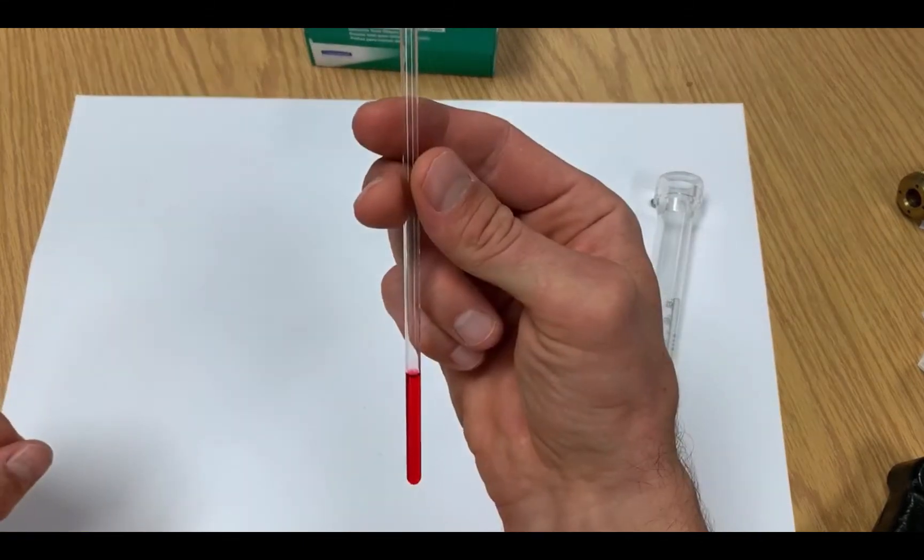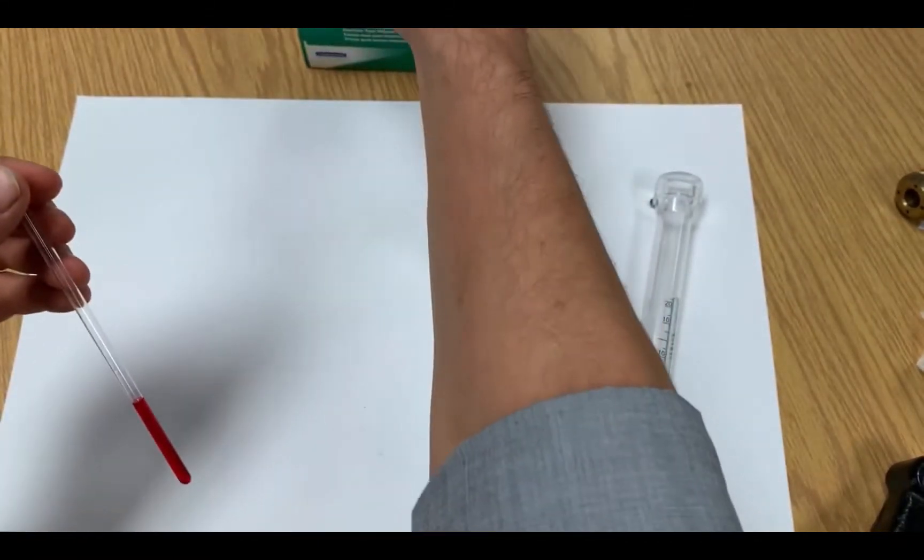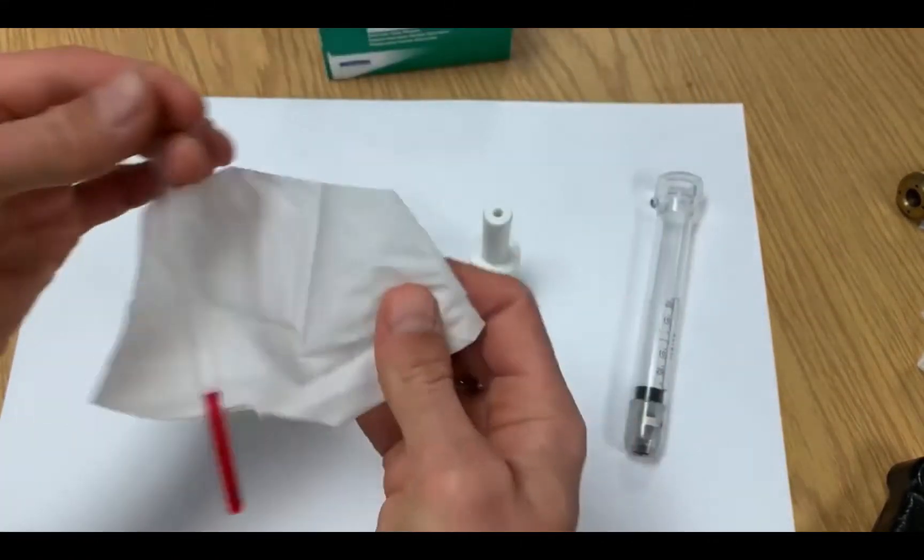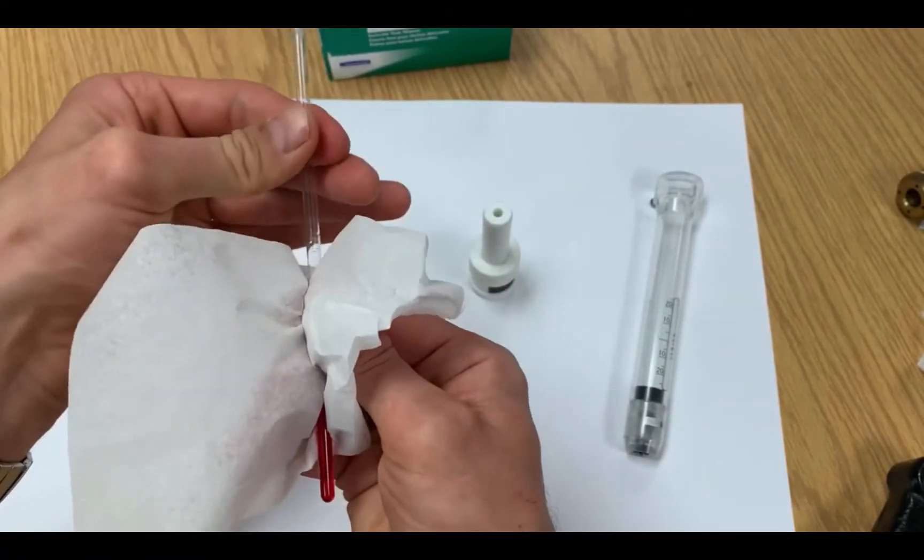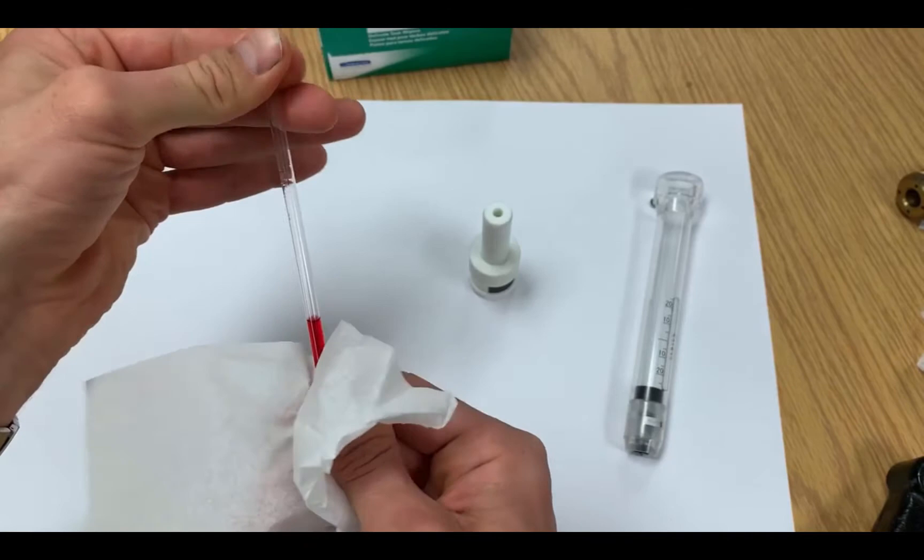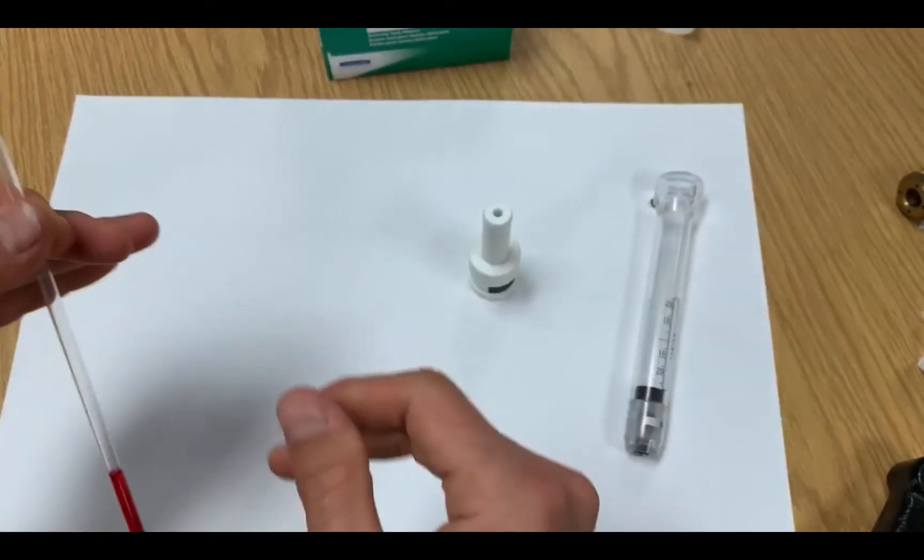It's important to always wipe your NMR tubes down with a Kim wipe before you put them in the sample holder. Any grease or dust that might be on the tubes will be transferred to the sample holder or eventually to the NMR probe.